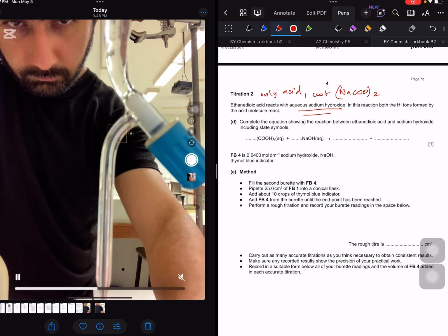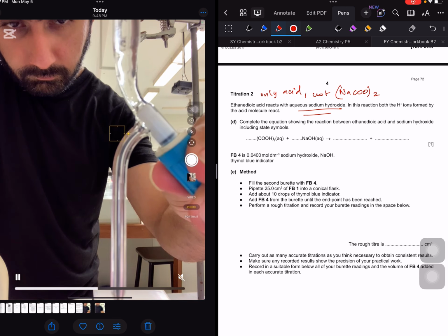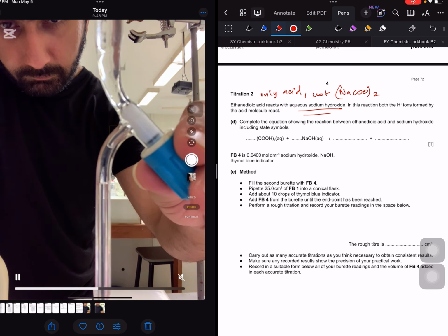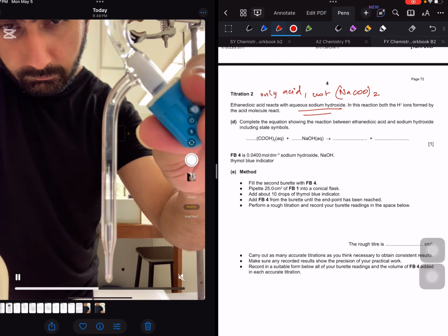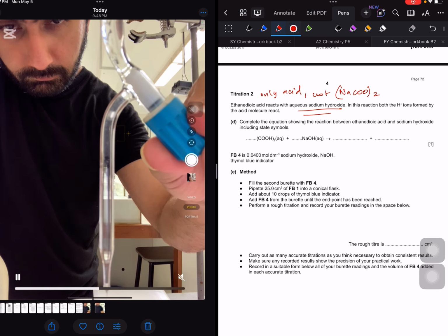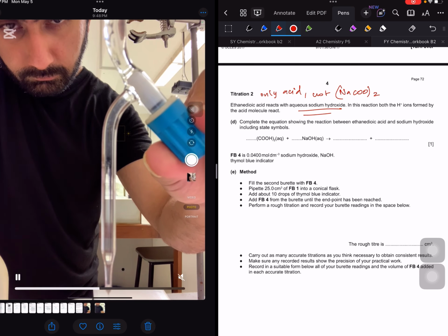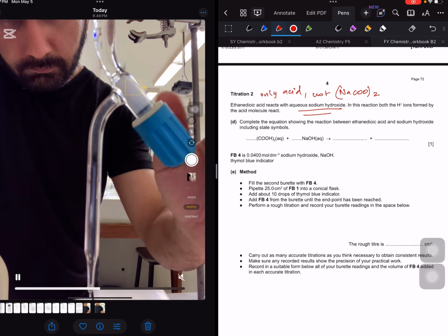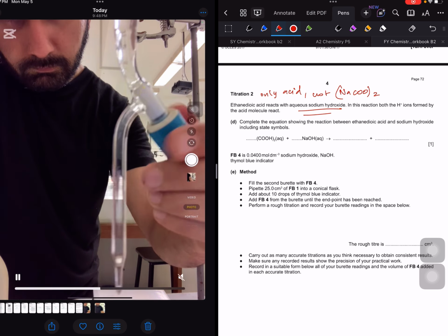Now this is an important thing. I want you to show that if there are any air bubbles in your burette, you open the nozzle and then you can see the air bubbles are passing through. This is exactly what you do before you fill your burette. Don't fill your burette completely unless the air bubbles have been passed away, have been removed. Why passed away? Why would I say that?